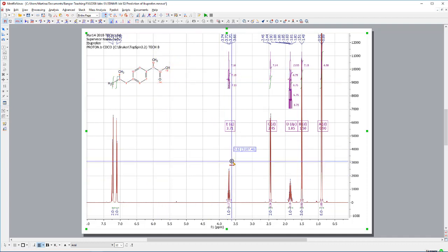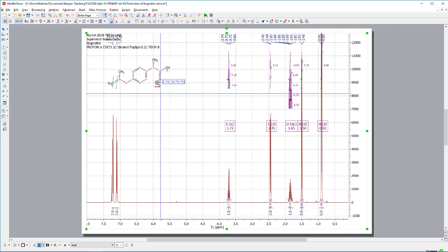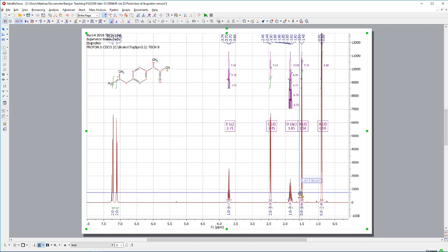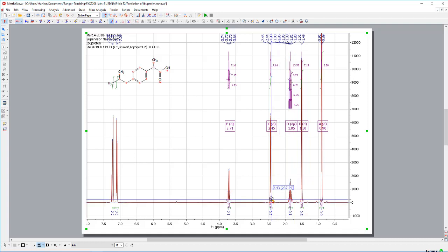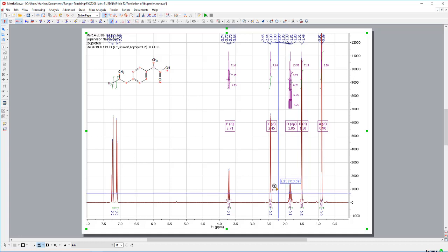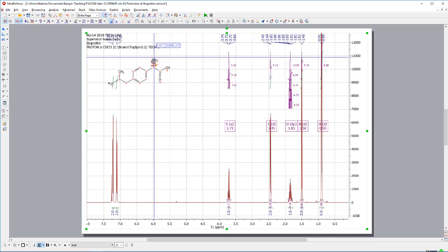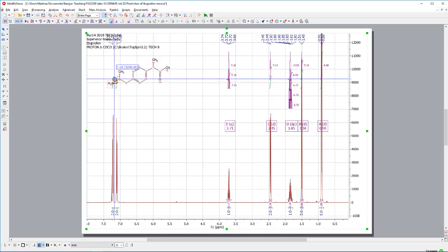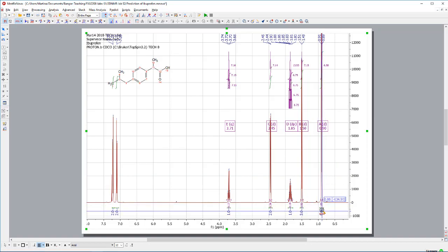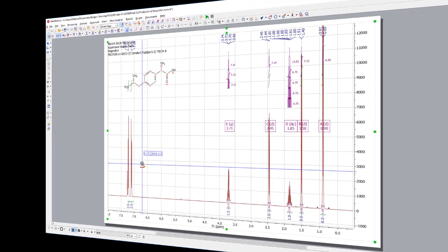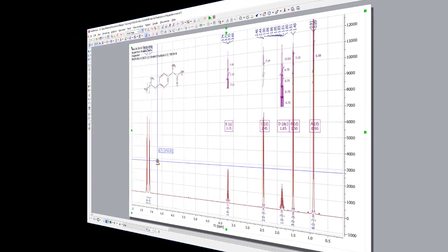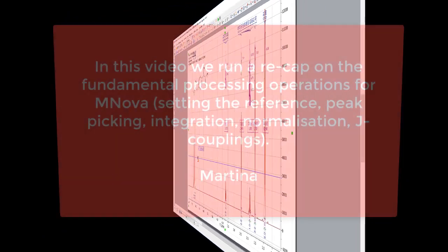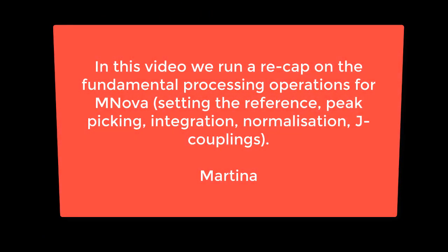So, it's quite likely that this signal belongs to the CH group. So, then this one must be the other one. Then, we have only one CH2 group. So, that must be this signal. And, then this is a single methyl group. So, that is supposed to be that signal. And, our two methyl groups here, they are overlapping, forming a duplet. And, they integrate nicely to 6. So, by this we have actually identified all the signals. And, we have done what we could. We obviously could run a report. But, at the moment I am not interested in the report at all.